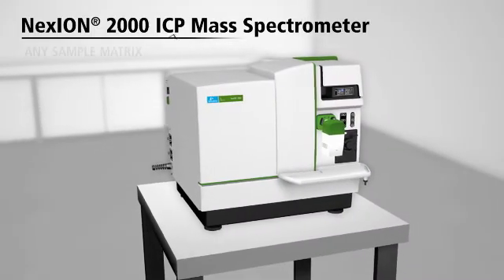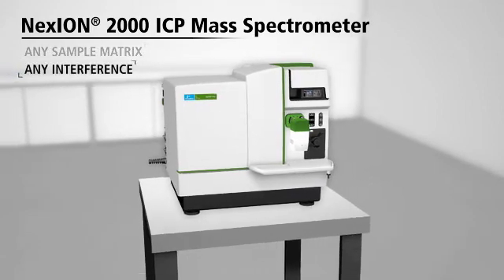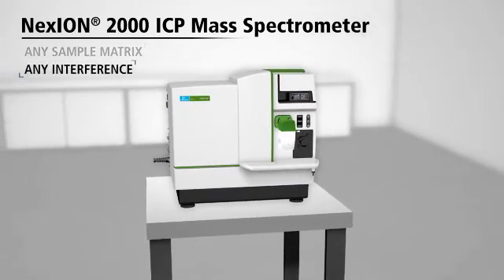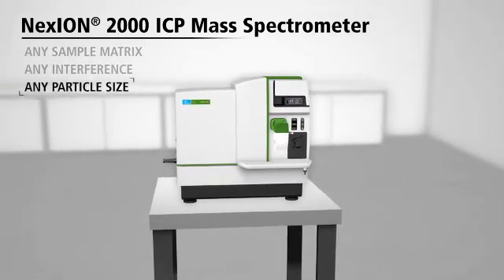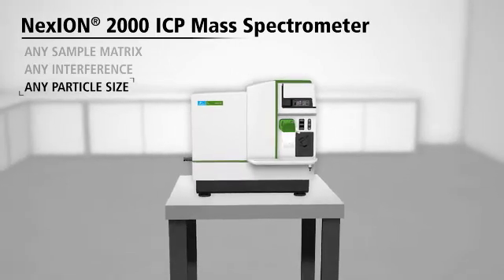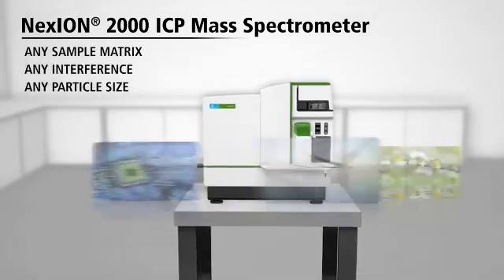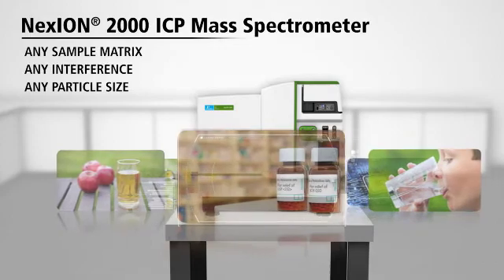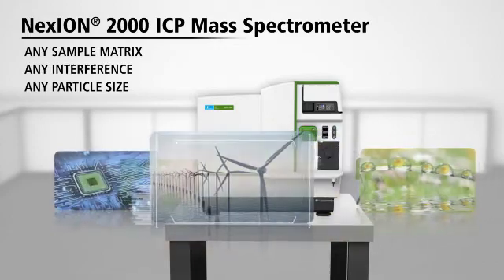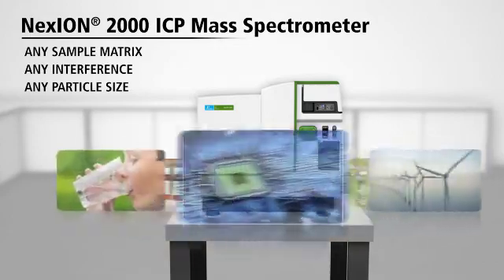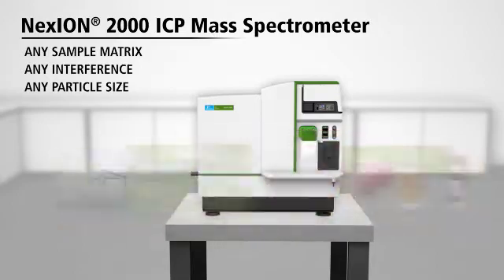Nexion 2000 ICP-MS empowers your lab with endless choices and possibilities, with powerful and flexible interference removal techniques, better detection limits, and maximum uptime, streamlining your analysis workflow with an all-matrix, all-sample, all-inclusive system. The new Nexion 2000 ICP-MS for effortless versatility.